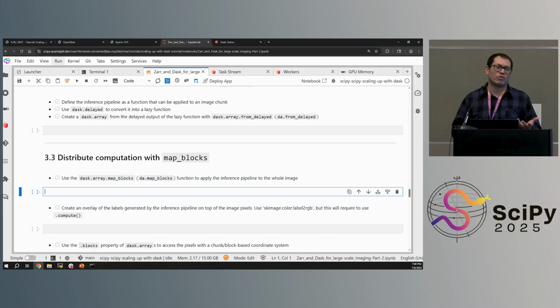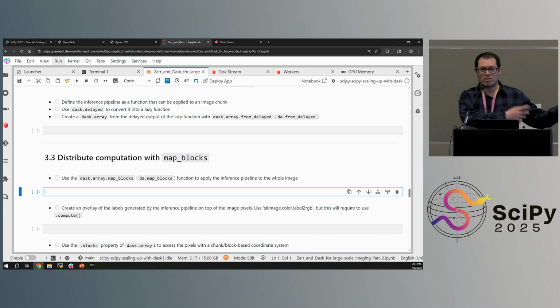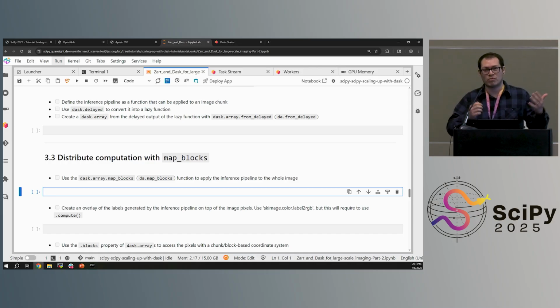So this is an effort from the bioimage community to have something that you can share with people, and they can still at least know where that image comes from, or what specimen it is, or from where that image was taken, the modality, the instrument that was used to acquire that image. So this is what makes the difference between the TIFF and the OME TIFF.